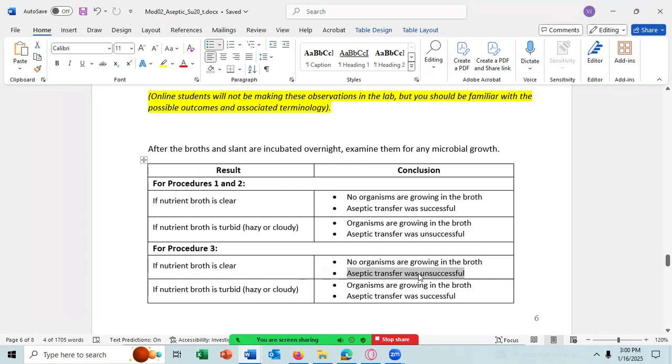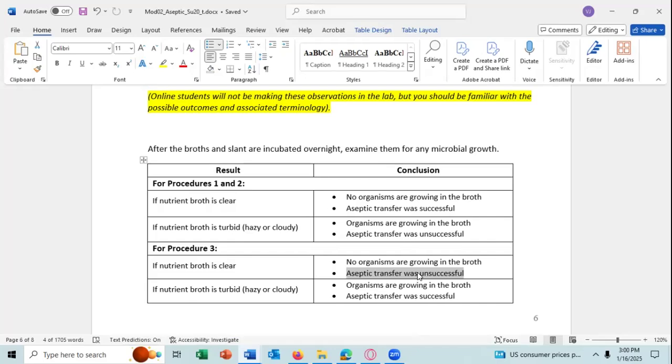Well, what are we doing in procedure 1 and what are we doing in procedure 3? Well, it said it's a colored pigmented bacterium, so is that the reason it should be colored? It should be colored, but what I'm trying to get at is in procedure 3, you're directly inoculating the tube with cells. And yes, they are colored.